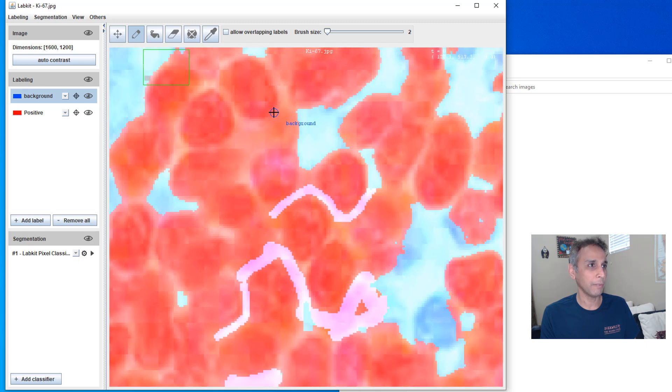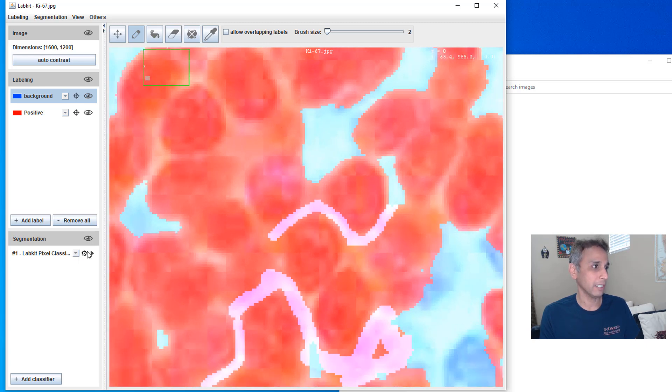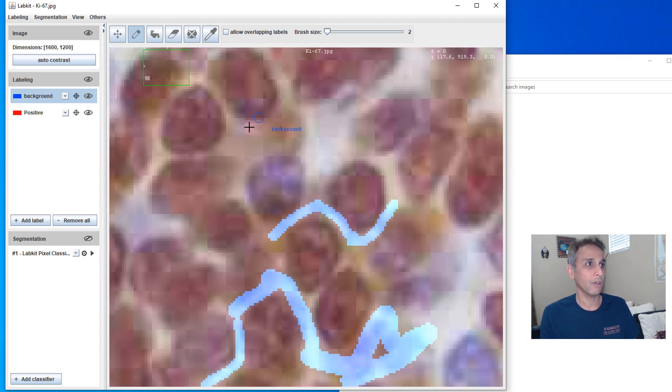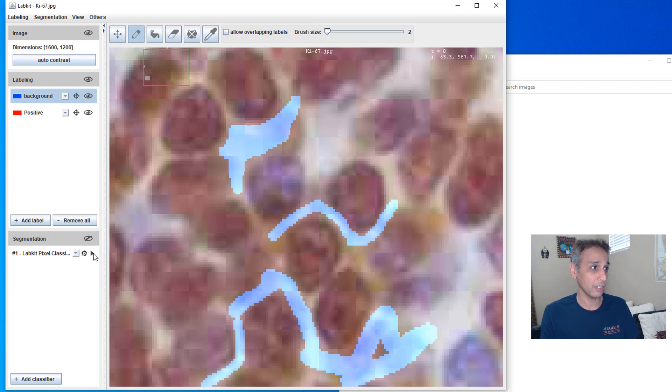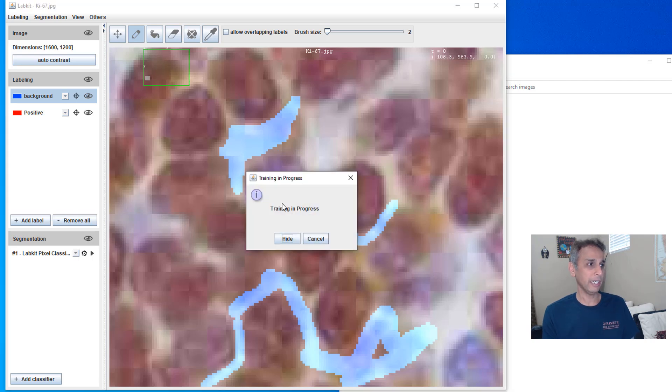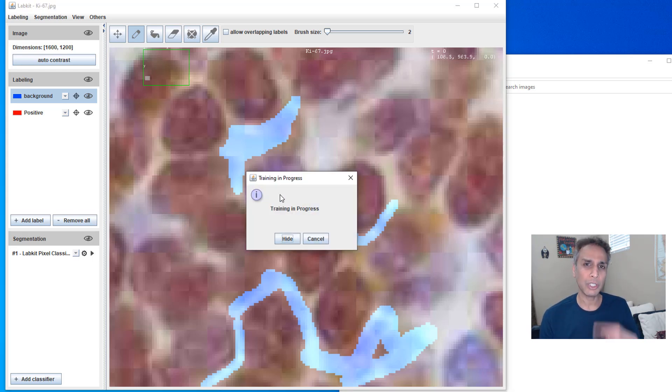And where else did it get wrong? It got wrong at many, many places. You see how it got wrong right there, but this time it should do a better job because we provided additional training, additional training regions. So let's go ahead and hit this training again. So it's an iterative process.